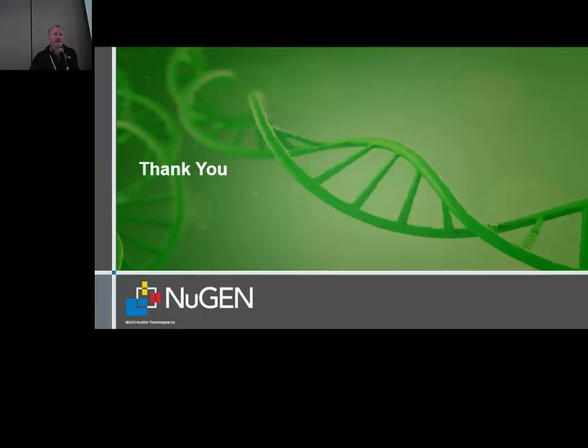Yes. The information for your design panels, let's say for the tomato, is that on your website? The information about the design for tomato. Yeah. How many SNPs on the panel, etc.? I don't remember off the top of my head the design for tomato and how many SNPs that is. These are all custom designs. So for this product, we don't offer a catalog design at the moment. There may be a point in the future where we would, but just about everybody's kind of got their own panel of SNPs that they want.